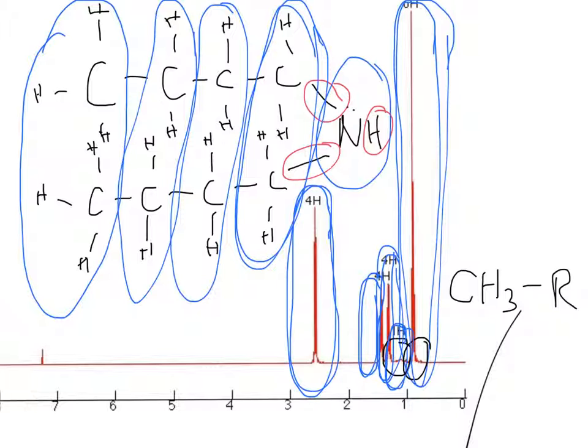Although it appears as though we figured out what the structure is for our molecule, we're still going to look at the carbon-13 NMR. And you can tell what the different kinds of protons are because each group has a different neighbor. This group right here has a CH2 neighbor to the right. This group here has a CH3 neighbor to the left and a CH2 to the right.